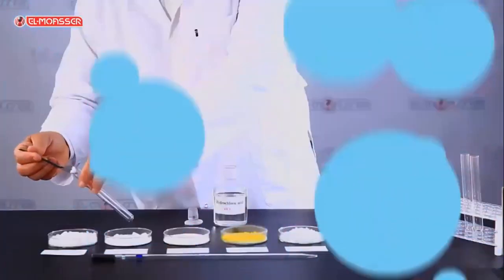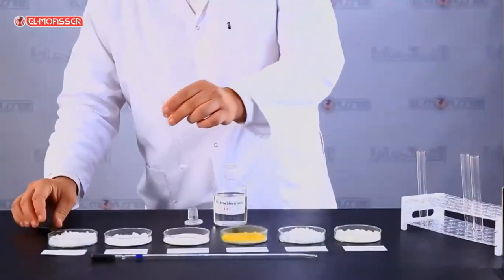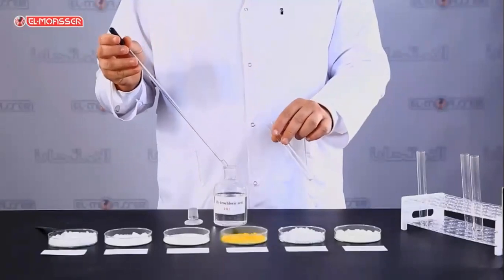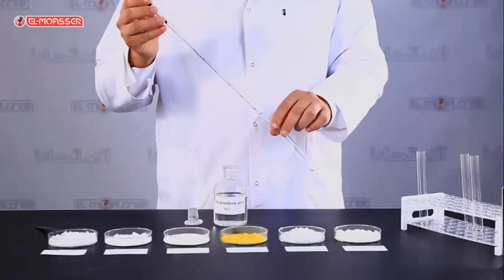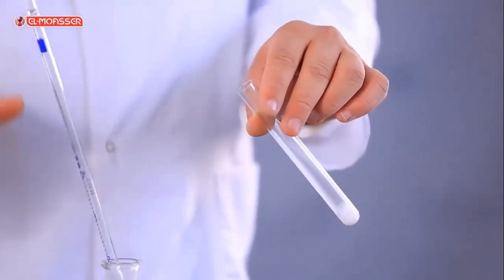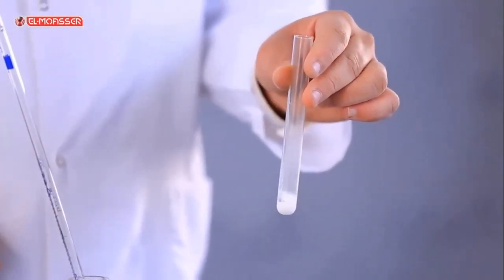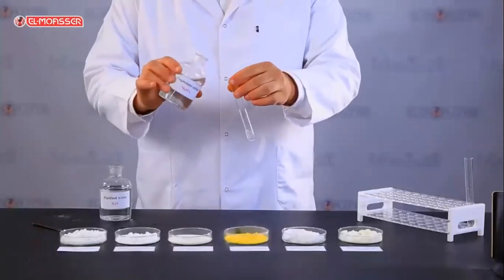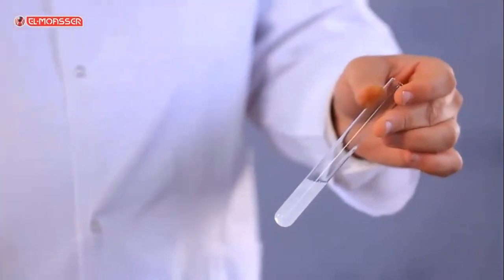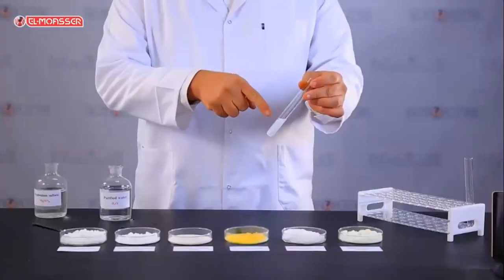Summary. On adding diluted hydrochloric acid to the sodium carbonate salt, effervescence takes place due to evolution of carbon dioxide gas. On adding magnesium sulfate to sodium carbonate, a white precipitate of magnesium carbonate is formed in the cold.